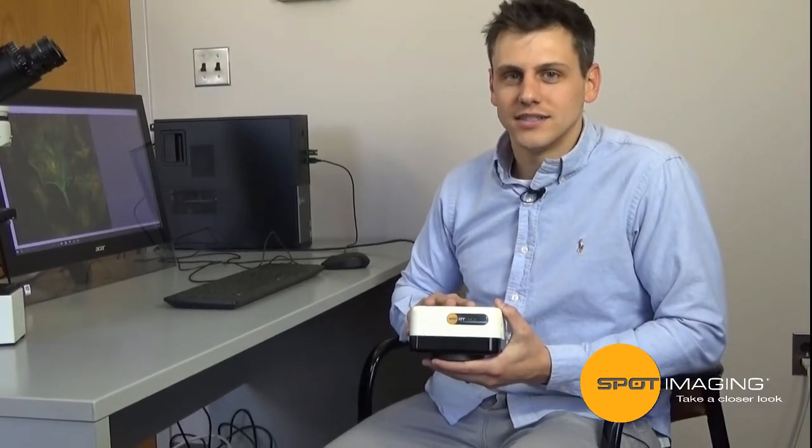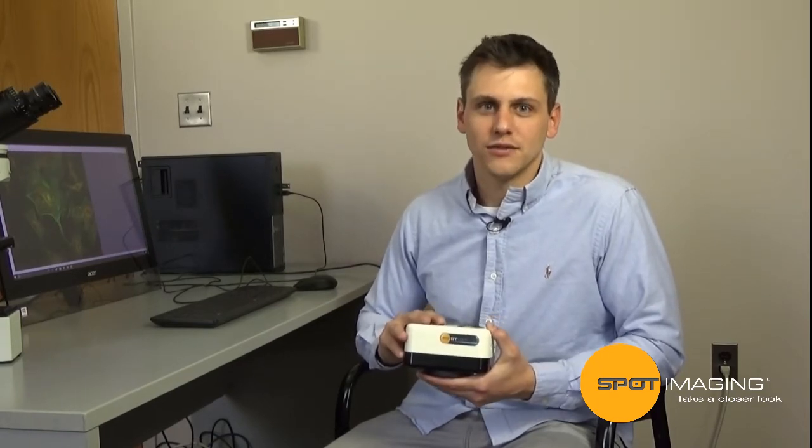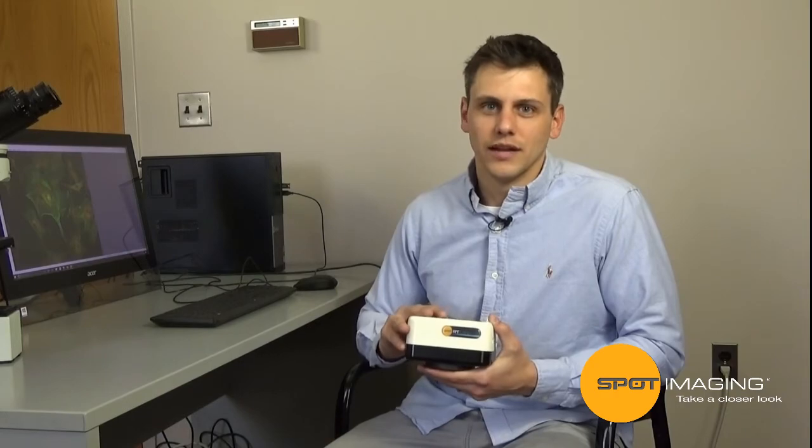Hi, I'm Mike Shimula, a design engineer here at Spot Imaging, and today we're going to take a closer look at the all-new Spot RTS CMOS camera. In this video, I'll show you why this camera is the best for your fluorescence and low-light applications.